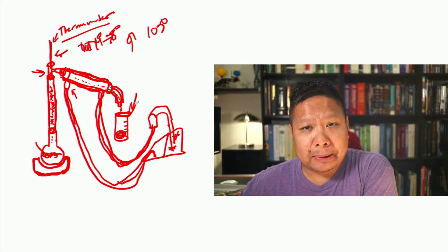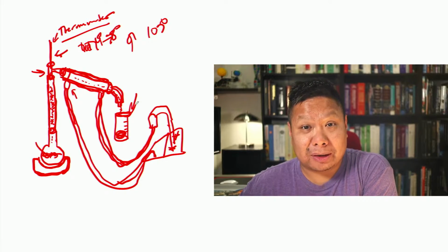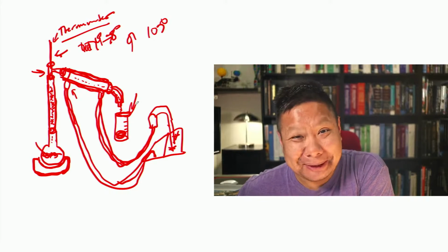So I know people have seen before, especially in chemical labs, ethanol that's like 100%. But the thing about that is that ethanol has been denatured, right, with other organic solvents, so that it will be able to be distilled from water up to 100%. And you definitely don't want to drink that stuff. So be careful.